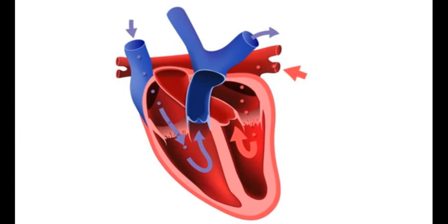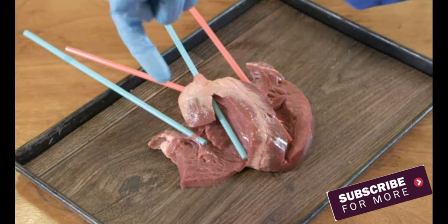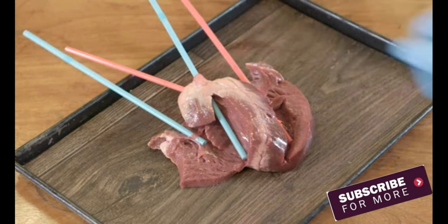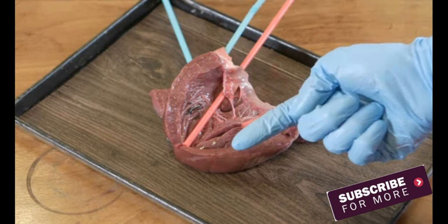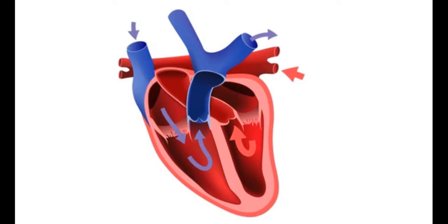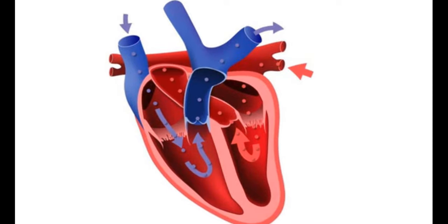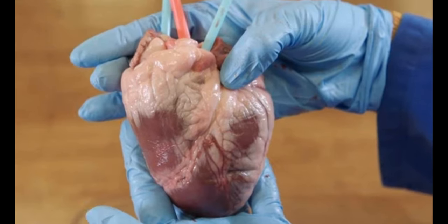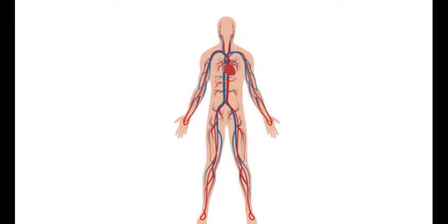Let's follow the path of the blood as it moves through the heart. Deoxygenated blood from the body flows through the vena cava into the right atrium, then to the right ventricle, and out of the heart through the pulmonary artery to the lungs. Oxygenated blood from the lungs passes through the pulmonary vein into the left atrium, then into the left ventricle, and out of the heart through the aorta. It is important to realise that the flow of blood through each side of the heart happens simultaneously. The left and right atria contract at the same time as each other, and the left and right ventricles contract at the same time as each other. It should now be possible to better visualise the pathway of the blood in and out of the heart.